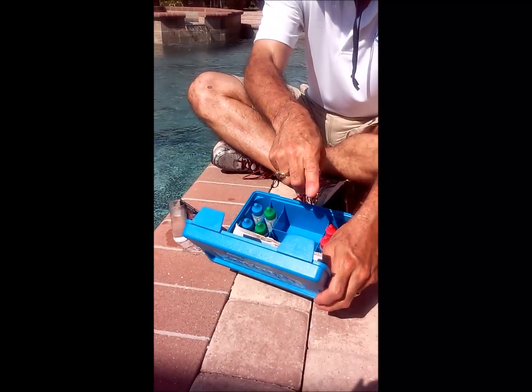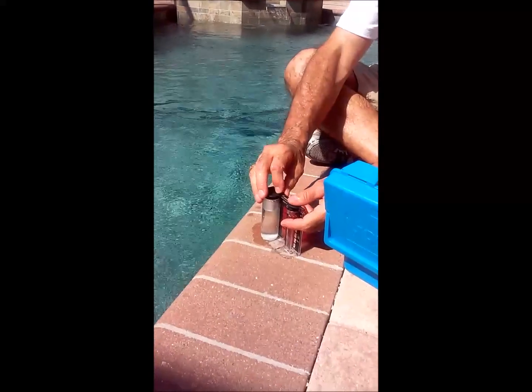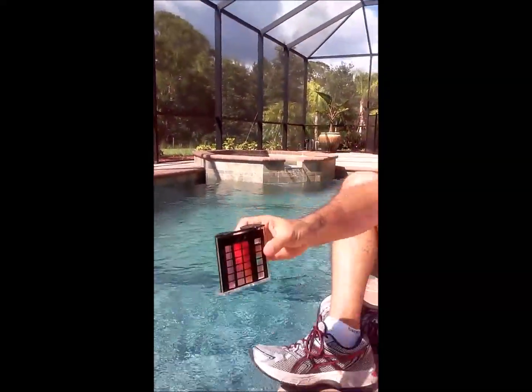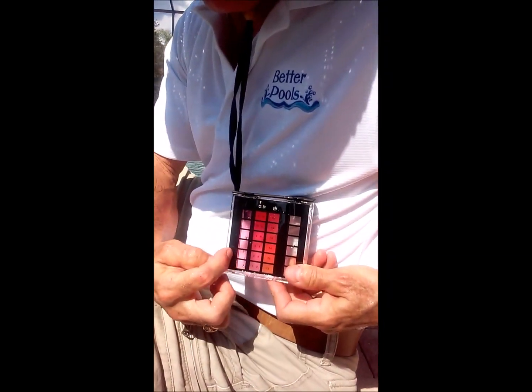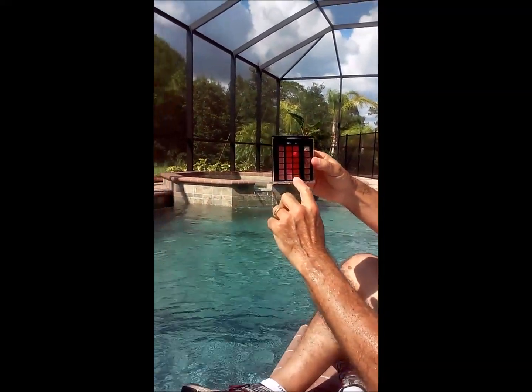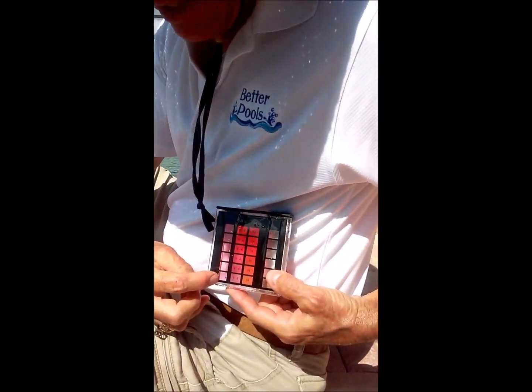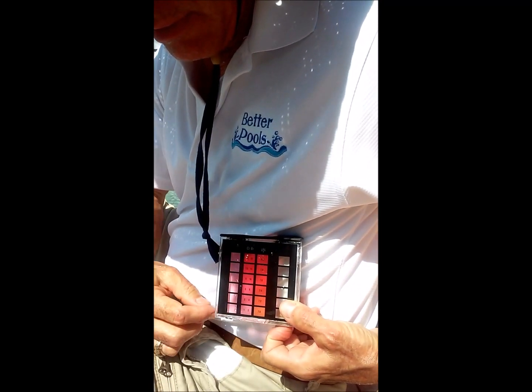As you read your instructions, you're going to mix it, add the cap, mix it, and match the color. Put the cap on, invert it a couple of times. It's best to get a white background — you can use a white shirt. You can see the color we're matching up, and it looks like we're at a one to two reading.